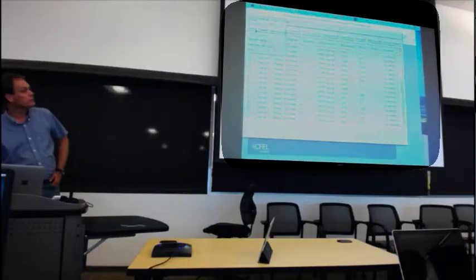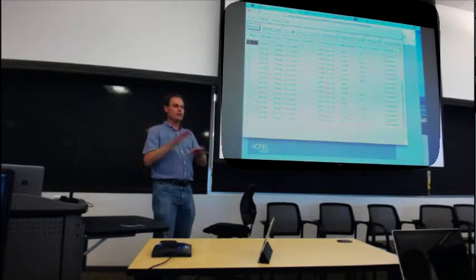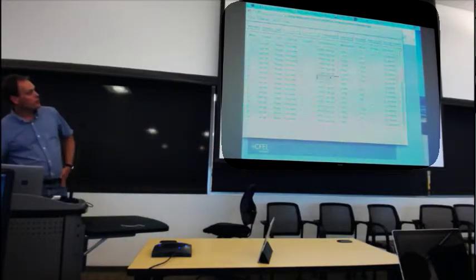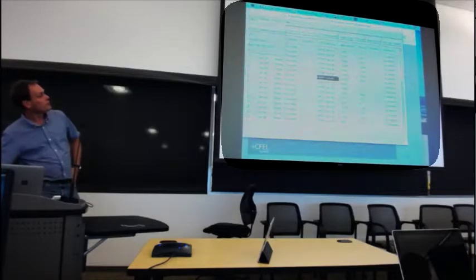And now, to make this run for yourself, you can unlock the command operations. It's set up initially so that you can't run the crawler, you can't submit new jobs. The idea is it will set up in a safe mode where one button press won't delete all your data and reprocess it by accident. Now you can still view things, you can still click on all of this and view the data and do everything else, but it's set up by default to put you into a safe mode so that someone won't mess it all up.